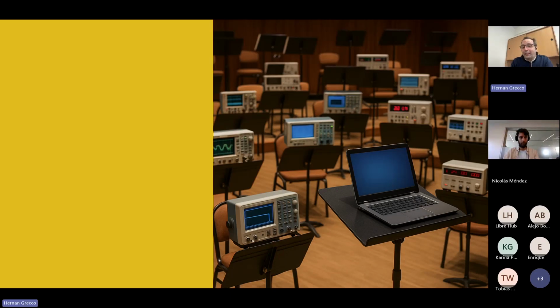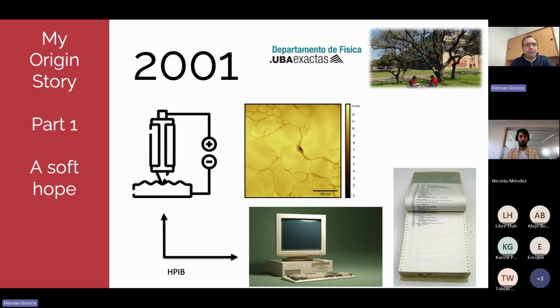So let's tell a little bit why I went into this. And actually, it all goes back to around 2001. I was working at the University of Buenos Aires between my undergrad thesis and starting my PhD. And we had this scanning tunneling microscope that was a very old device with a control via HPIB, which is, let's say, a version of GPIB for those of you who know about this. And it was running software written in HP BASIC, Hewlett Packard Basic, which was talking to the instruments and saying what are the instructions that you need to do.